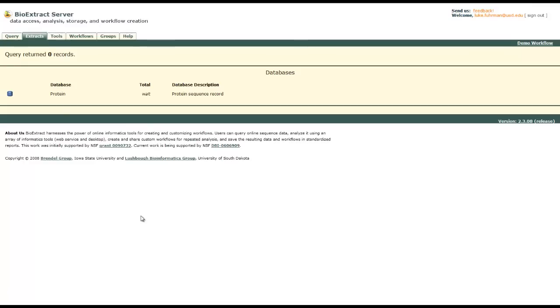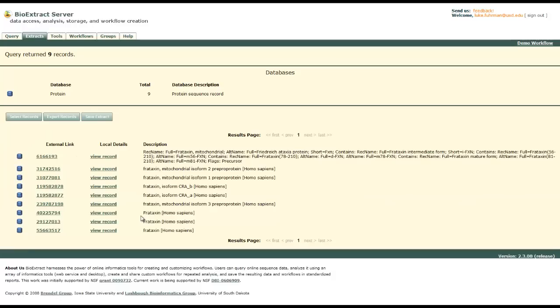For this BioExtract Server, we'll pull them all up right in the extracts page. We can use these files directly from this page without having to save all the data.